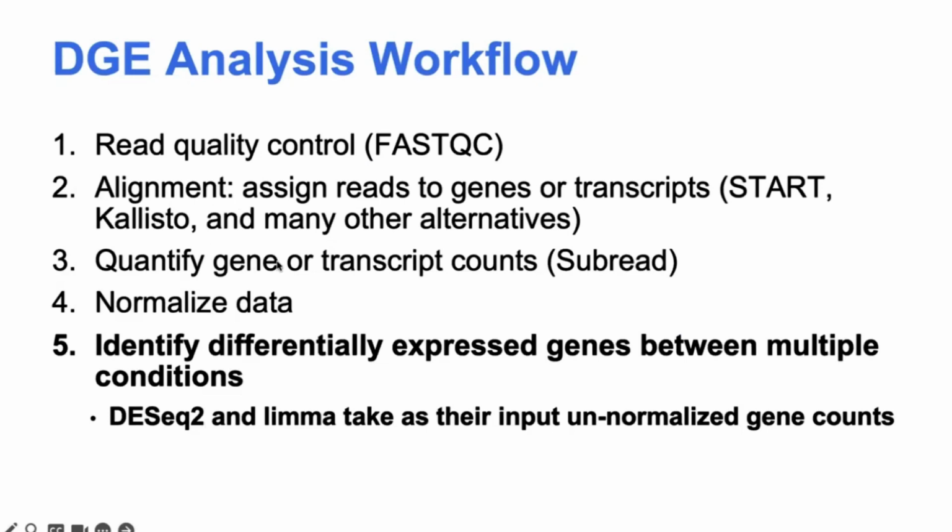Different DGE algorithms take in different inputs depending on what's already built into the package you're using. For some of these methods, you might not need to do your own normalization. DESeq2 and limma are both methods like that. They have their own normalization that gets implemented when you apply the function, so you're going to want to feed in unnormalized read counts to these two methods.